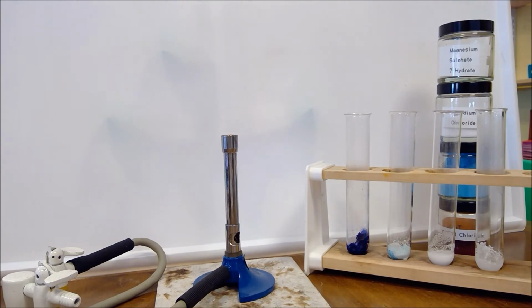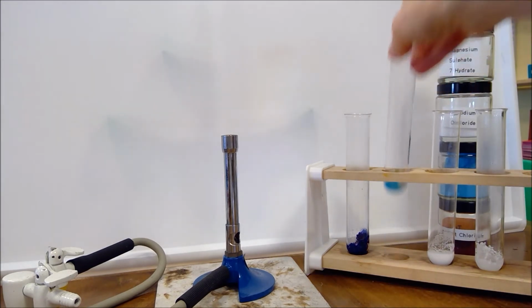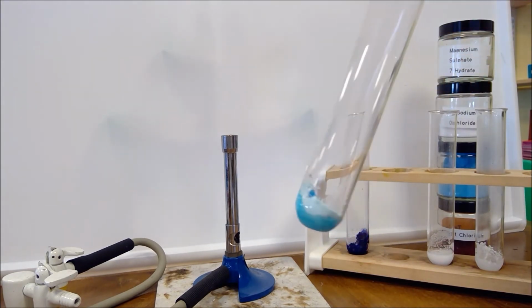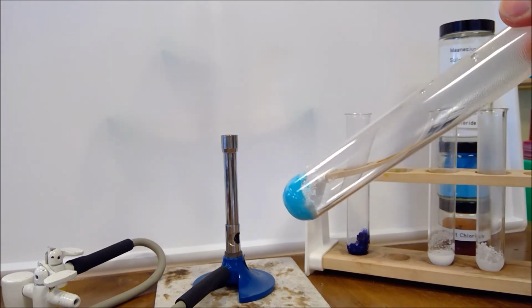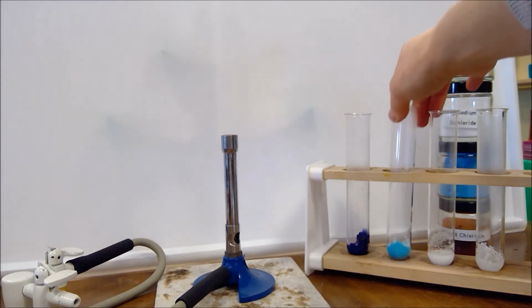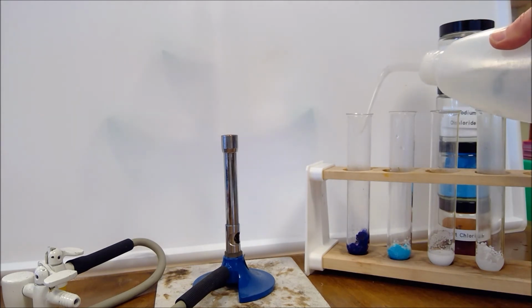Now onto the white copper sulfate. So I'm going to squirt it down the side if I can. There we go. All right, so can we see how that's all gone blue? And then finally onto our cobalt chloride. It's hopefully cooled down enough for this not to fizz everywhere.